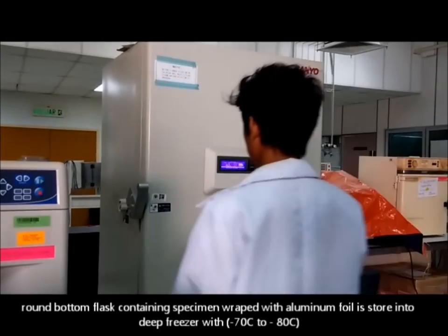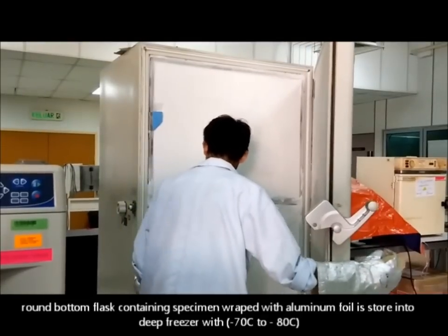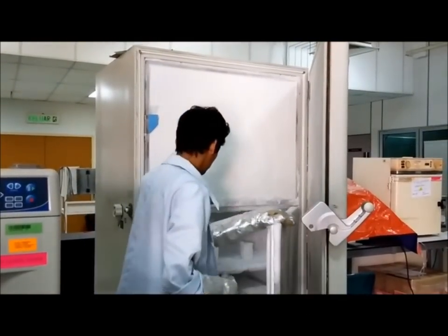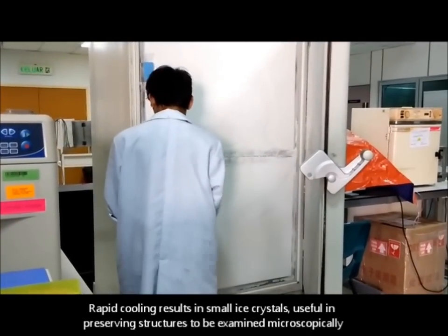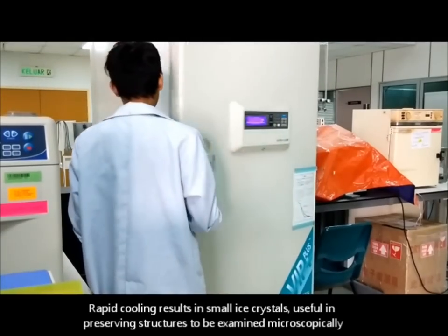A round bottom flask containing the specimen, wrapped with aluminium foil, is stored in a deep freezer at negative 70 degrees Celsius. Rapid cooling results in small ice crystals, useful in preserving structures to be examined microscopically.